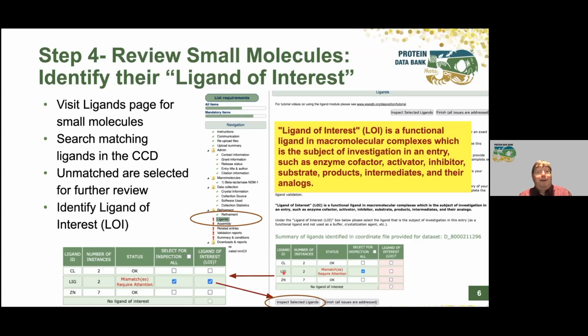Now you're going to have 3 choices of how to resolve these issues. Either it's a match, so something that's simple, let's say ATP, you probably will not have to do anything with. It'll be fine, and it's like the chloride ions here. You might have to address the match by saying, oh, it's really another element that we have. I'll show you that example in a moment. Or maybe you're going to have to give it a more detailed description.